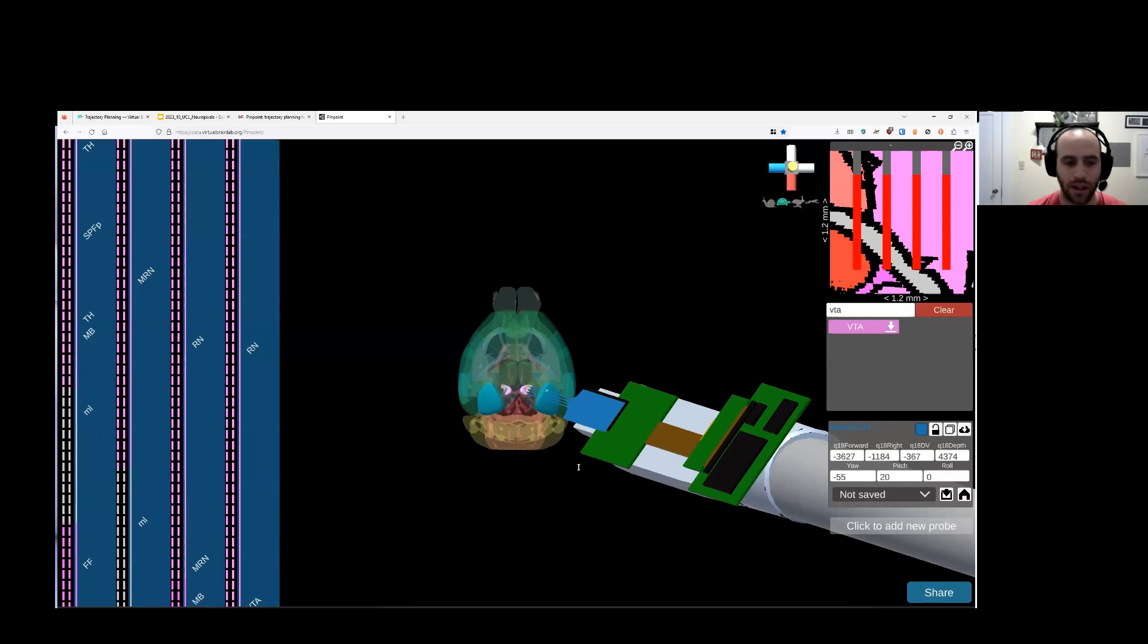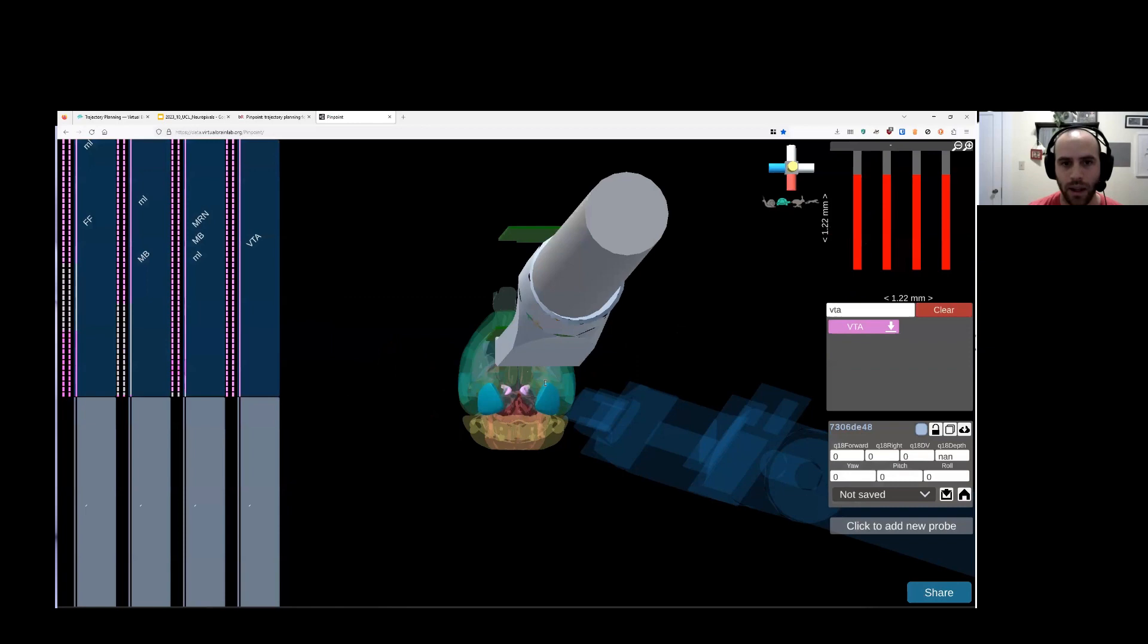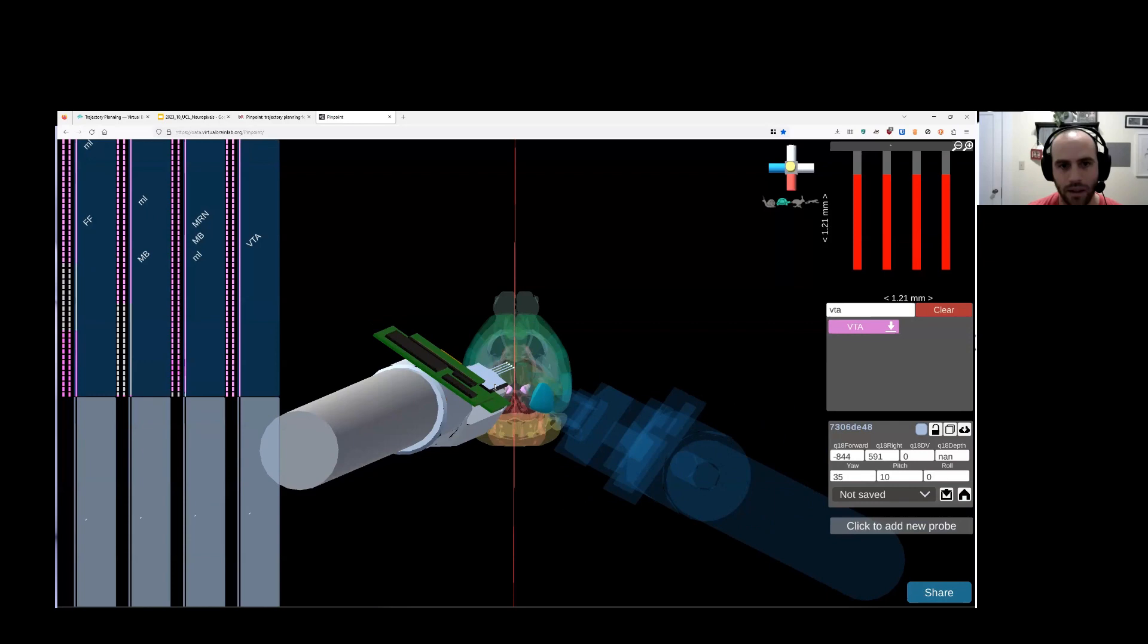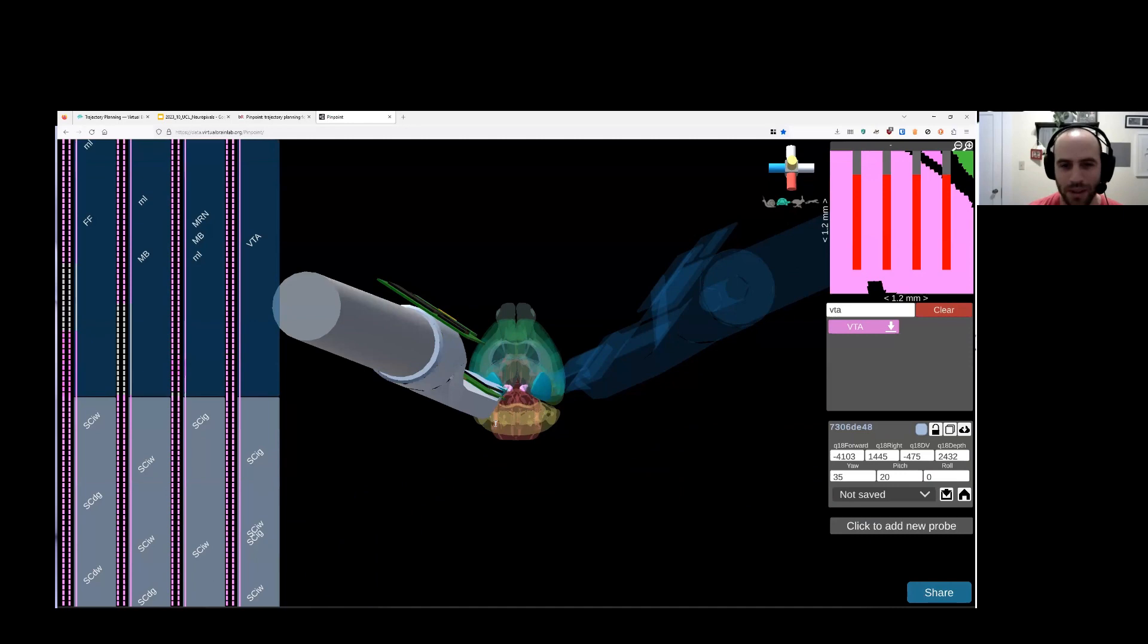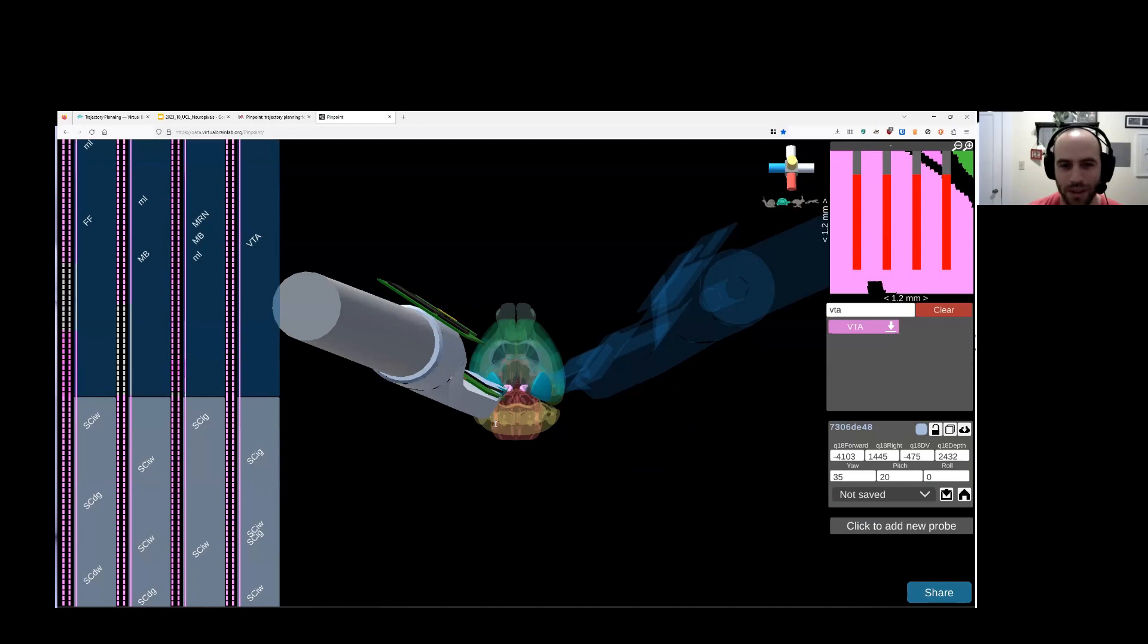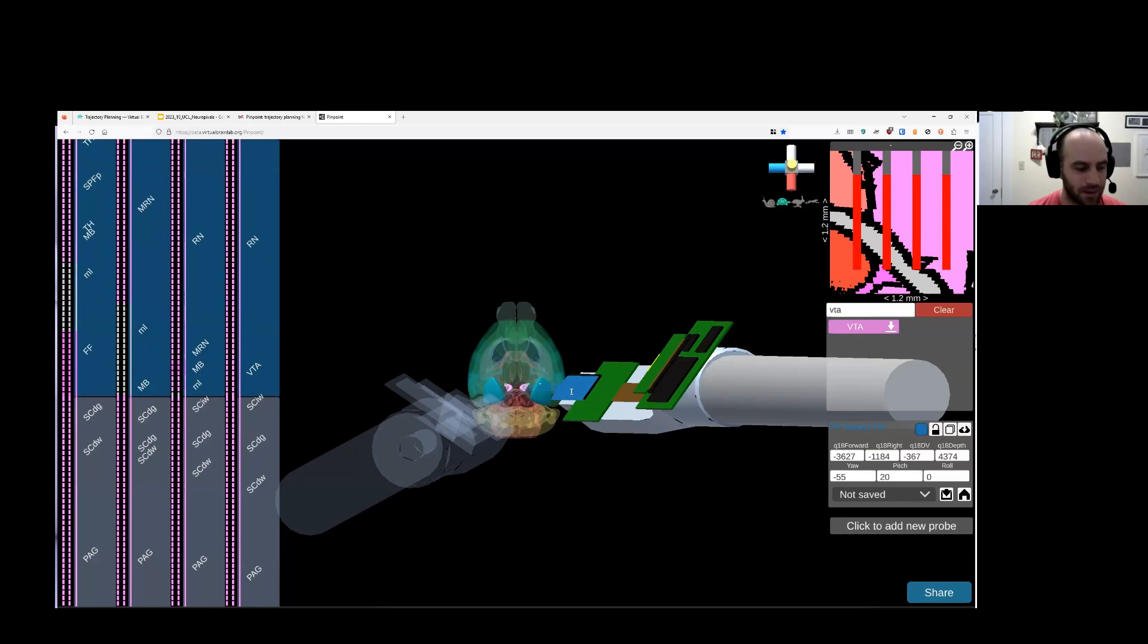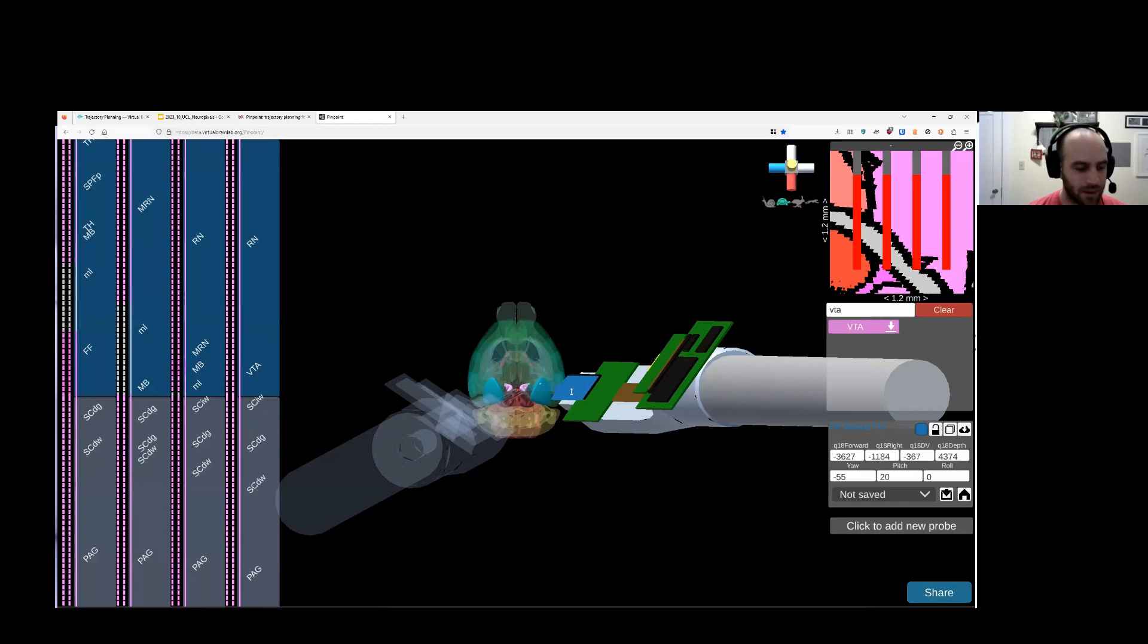One nice thing about Pinpoint is we design the software with the intention of building multi-probe insertions. So we can easily click to add a second probe and drop that in the scene. And then we can rotate this probe to create a second insertion wherever we might want to go. And for people who are planning multi-probe insertions, you are often worried about probes colliding with each other. So we do have automatic collision detection in this 3D scene. If your probes are going to hit each other, we pop up a warning. And that's a setting that you can turn on and off if you don't want to see it popping up all the time. To switch back and forth between probes, you just click back and forth. Okay, so that's the basic setup for planning a multi-probe insertion.